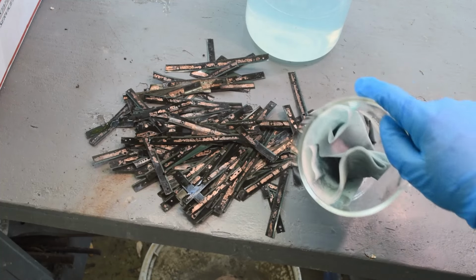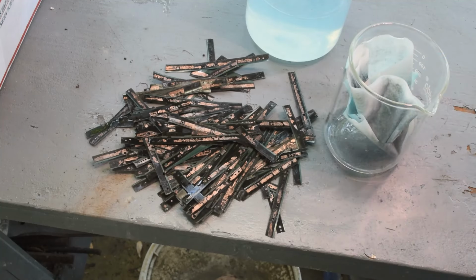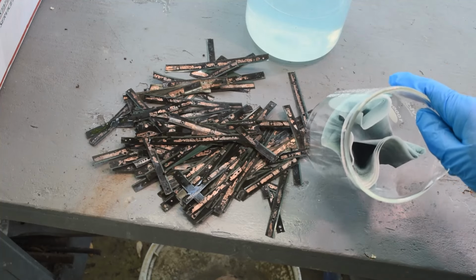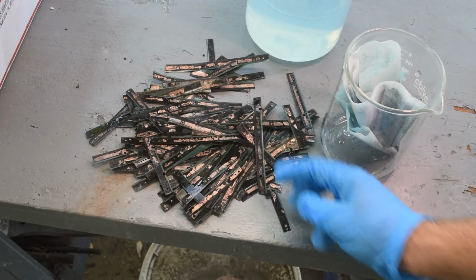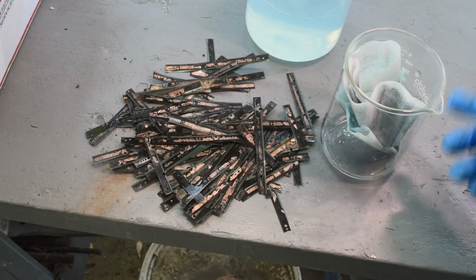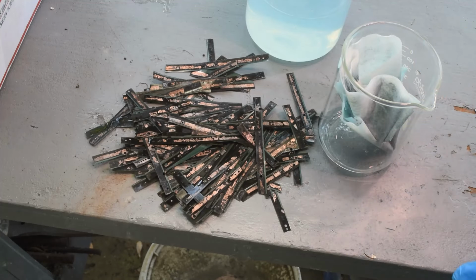And then once we have enough palladium metal built up, we'll go on to refining it and turning it into pure palladium, because this stuff is really contaminated with all kinds of stuff. It looks like black and green bits from the substrate, copper. There's probably some other stuff in here, and probably still a little bit of nickel that has come across with it. So yeah, it's going to have to be refined. We'll work on that in a future video too. But I hope this has given you some idea where you need to go with this, Joven.